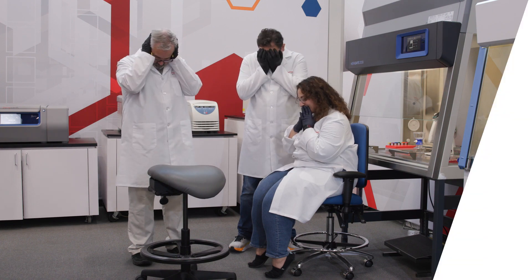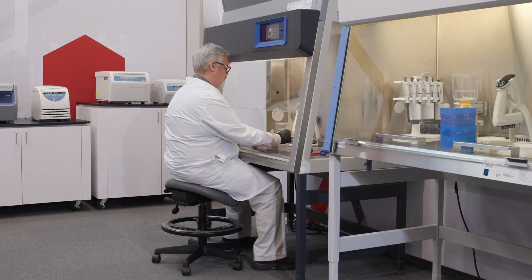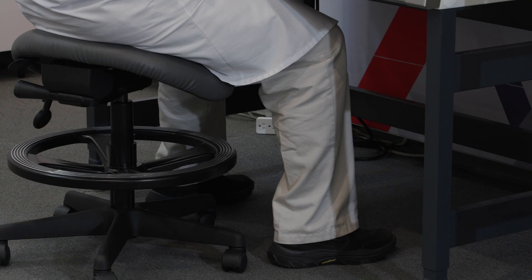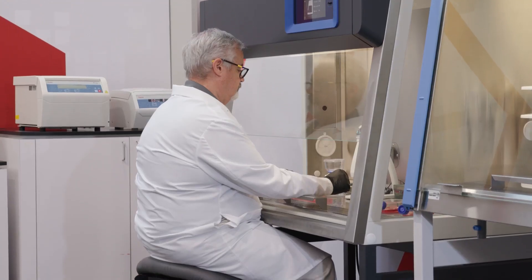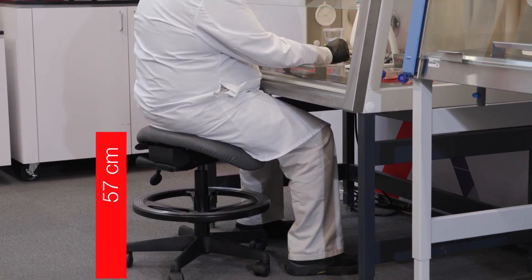For many laboratories, a saddle stool promotes good posture and makes it easier to work inside the biosafety cabinet. For Dave, with the cabinet set at the standard height, there are no other changes. The saddle stool is set at 57 centimeters and no footrest is needed.